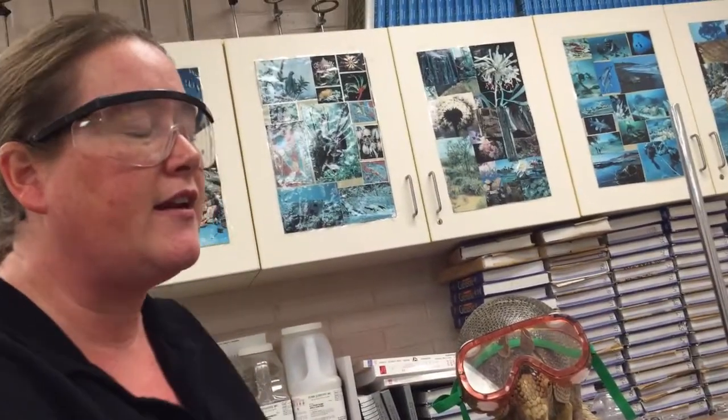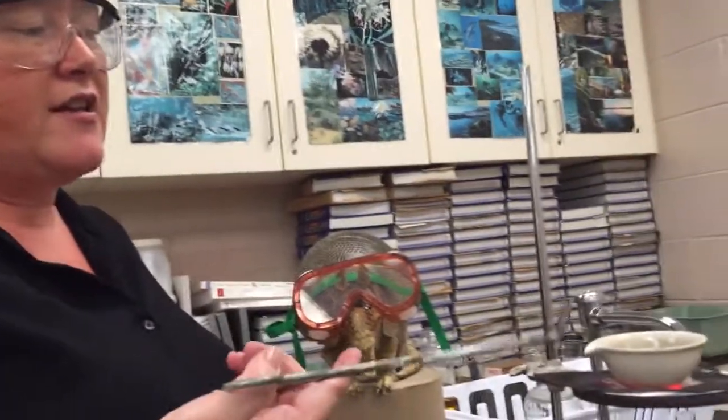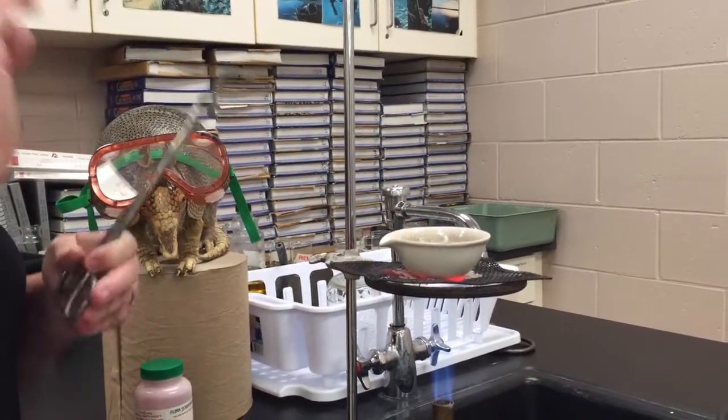It has oxygen in it, has carbon dioxide in it. So in this heated environment, and even if it were not in a heated environment, if the element were exposed, it could potentially be having chemical interactions at the atomic level where those atoms are interacting.